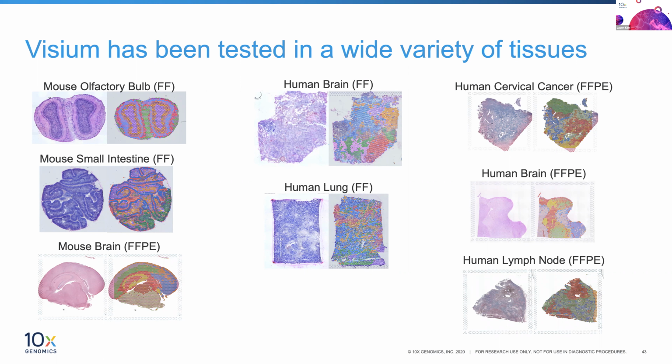For the most part, Visium has been out a good long while to see what tissue types have worked successfully. I'll say that if you're working on pancreas, salivary glands, or anything that has strong enzymatic activity, you'll probably want to do due diligence and talk to your science and technology advisor or FAS from 10x about different approaches, because we've had conversations with others who have done it either successfully, or at least it's been an elimination activity of eliminating what absolutely does not work.